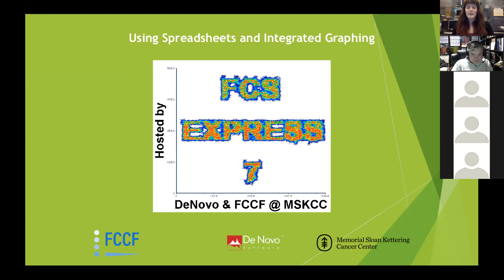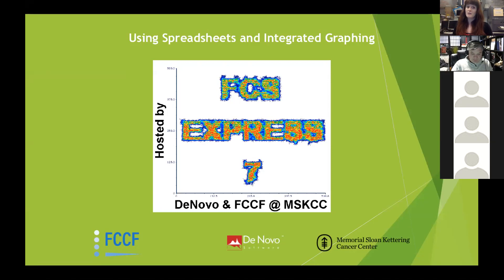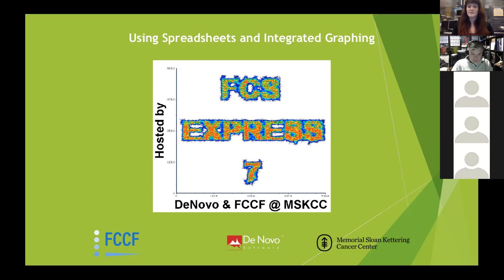As I just mentioned, this is our fifth session. During our work-from-home period, we've worked on quite a few introductory FCS Express 7 virtual classrooms over the past couple of weeks. Today we're going to focus on using spreadsheets and integrated graphing in FCS Express 7. I'm going to go over a couple of introductory slides before I pass it over.